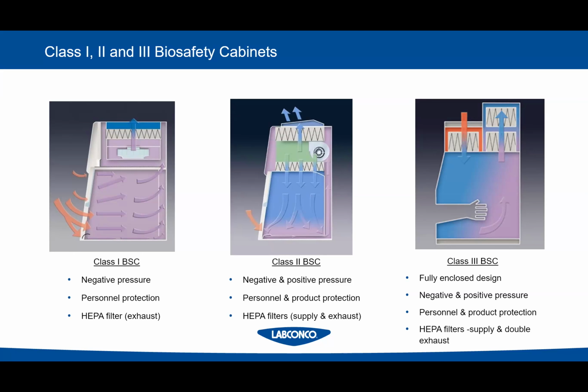Does this one down here look familiar to anybody? We were just talking about it, right? A powder enclosure. It draws air in the front, pushes air through a HEPA filter. This is considered also a class 1 BSC when it has a certain airflow, okay? So those powder containment hoods can also be considered class 1 BSCs. Our class 1 unit is a little different in that we don't have that bag in, bag out HEPA filter. So you don't necessarily need it in a bio process because we can decontaminate biological safety cabinets.